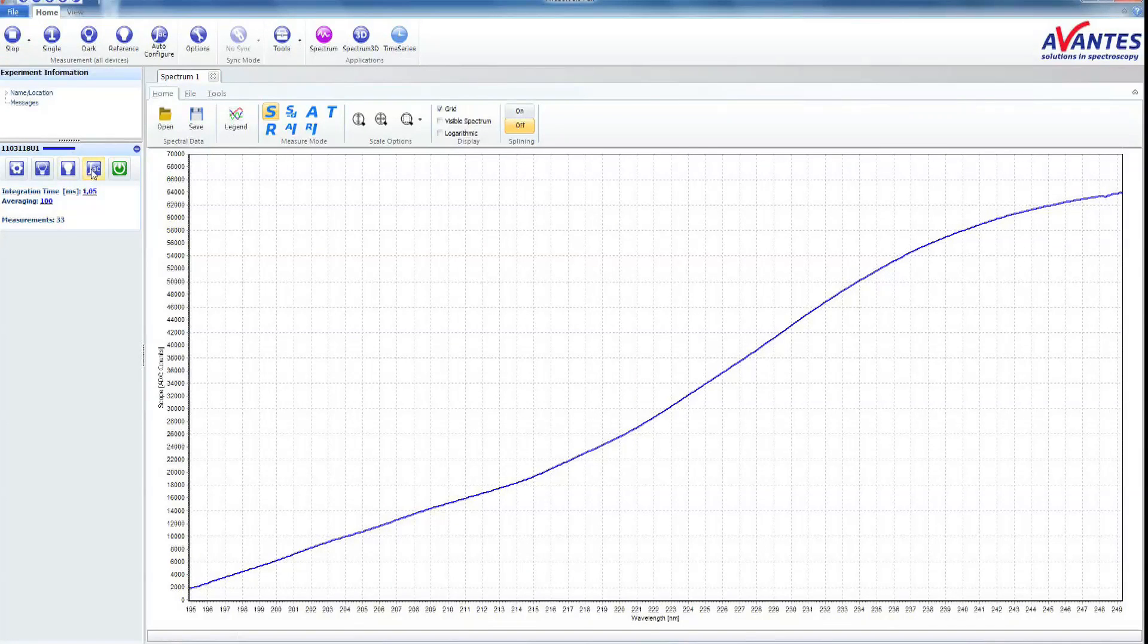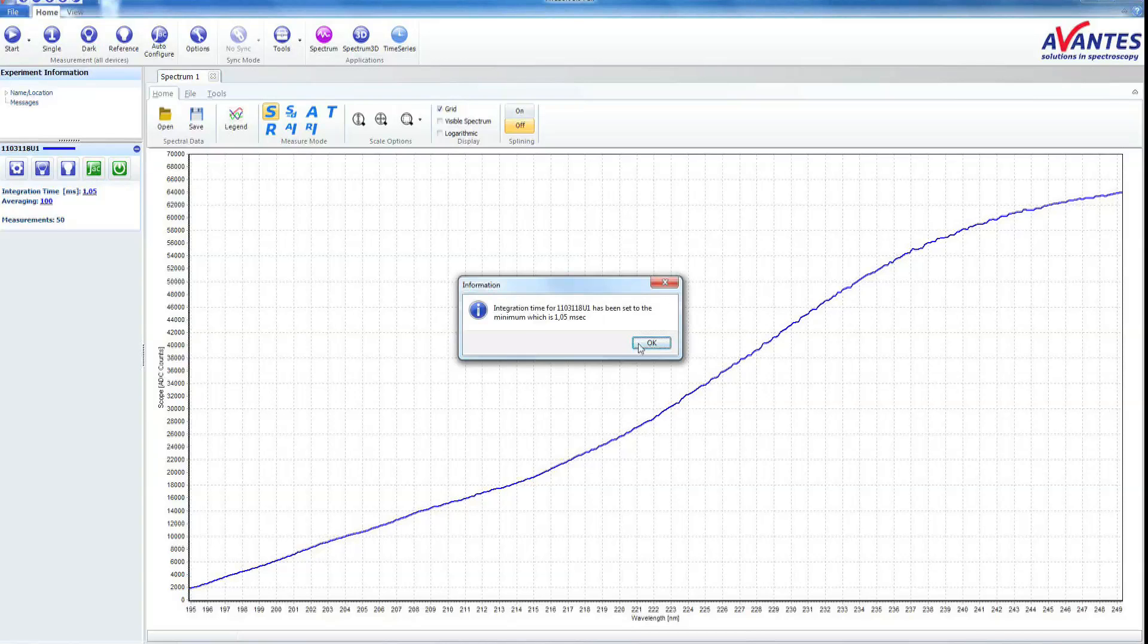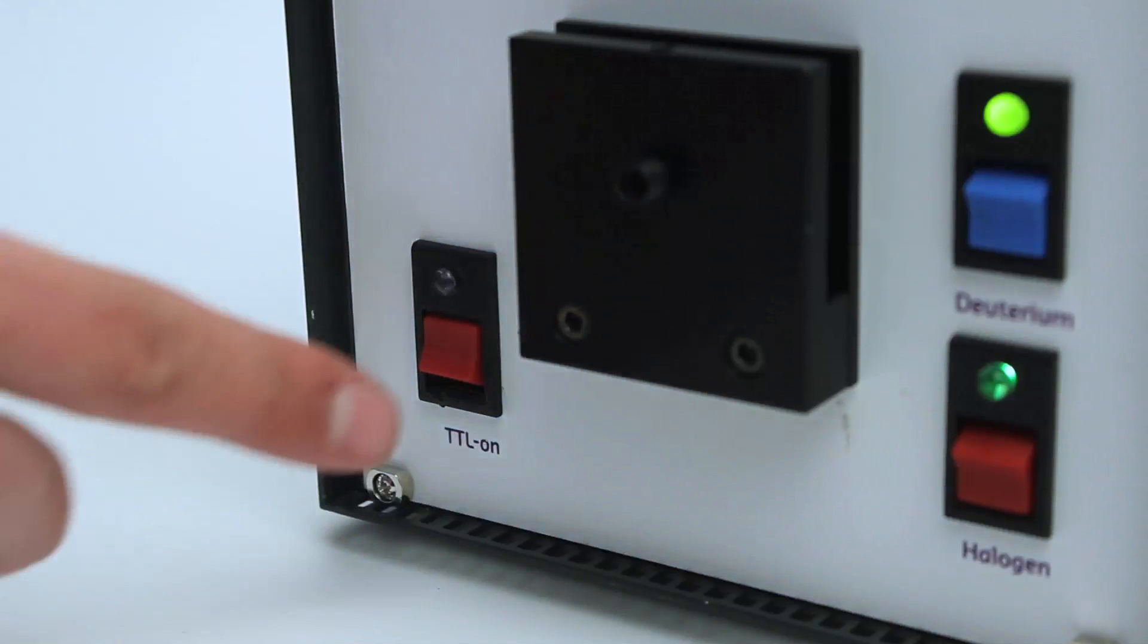Click the Auto Configure button to calculate the best possible intensity and number of averages. Please open the shutter.